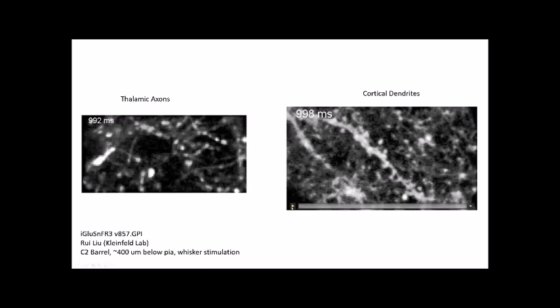It's really a bit of a mystery to us exactly what's going on. The anatomy looks fantastic with SGZ virally expressed, but functionally we basically see very low levels of brightness and very poor functional responses. Would you still say that for axonal imaging, PDGFR is the best option, even though you said that GPI has the best signal to noise? I think that's right, especially in vivo. In culture, I would say just use GPI all the time for everything. For axonal imaging in vivo, PDGFR for a given titer of virus is brighter for us. It just expresses more highly at a given viral titer.